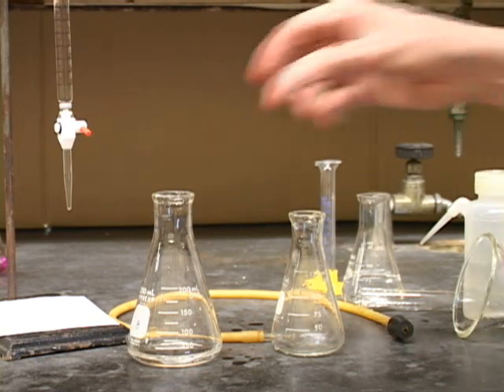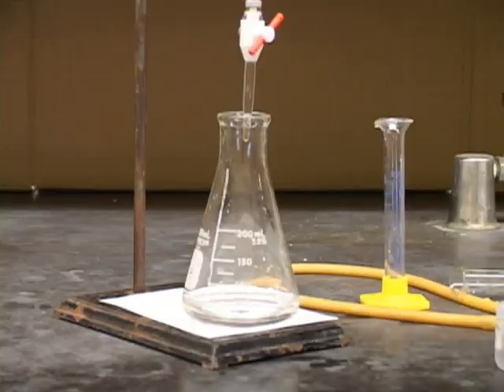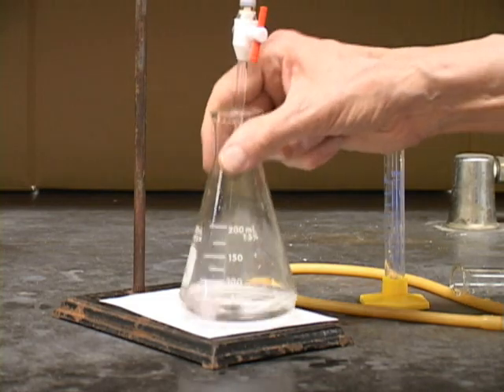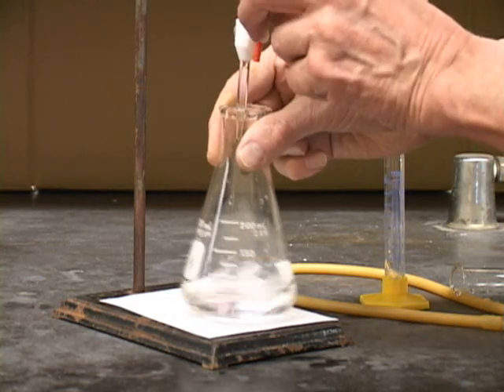Now we are all set to titrate. You can add the sodium hydroxide fast at first, but keep stirring.